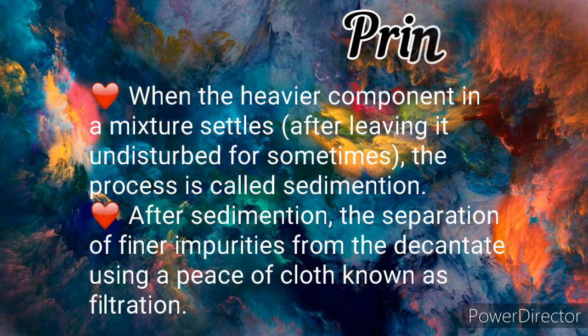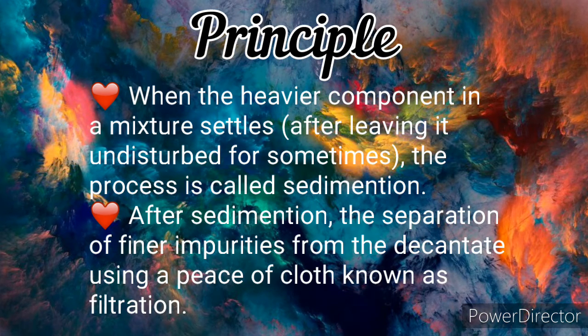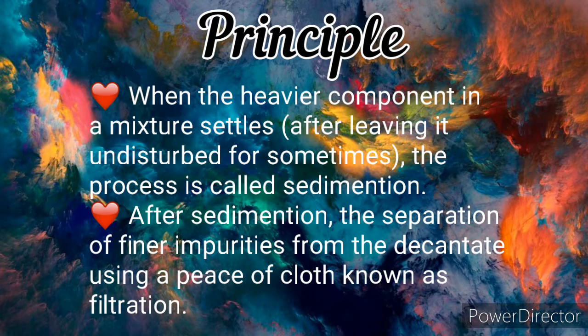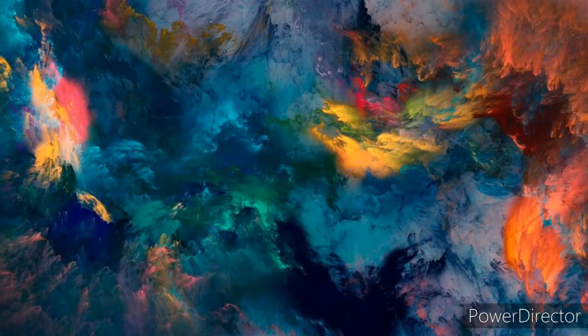Principle: when the heavier component in a mixture settles, the process is called sedimentation. After sedimentation, the separation of finer impurities from the decanted liquid using a piece of cloth or tissue is known as filtration.